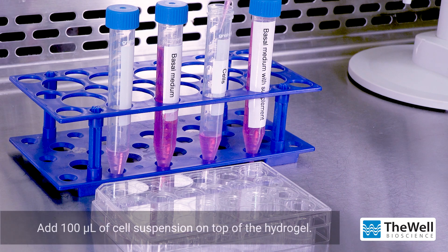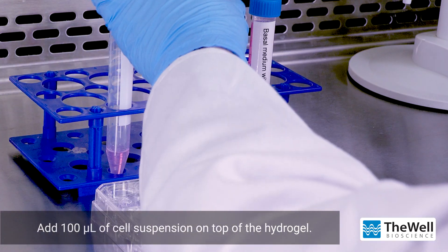After incubation, add 100 microliters of cell suspension on top of the hydrogel.